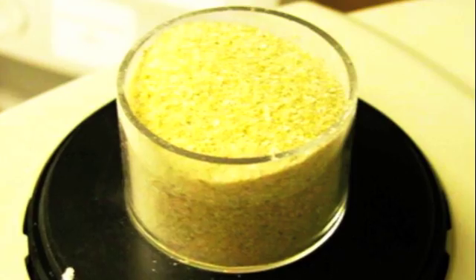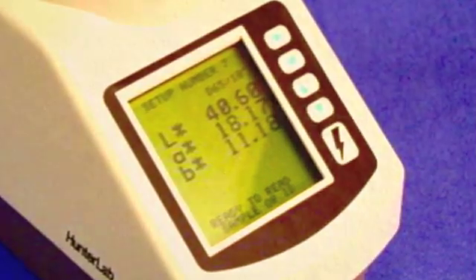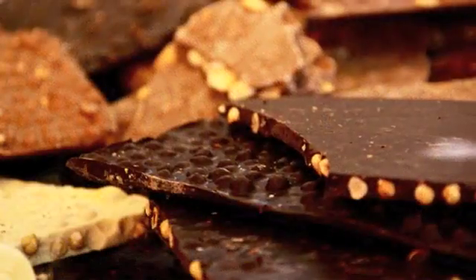HunterLab systems measure reflected and transmitted color of food products. They give numerical values that correlate to what you see and are ideal for measuring anything from raw materials to the final product.